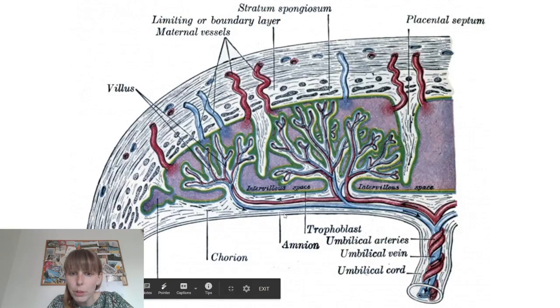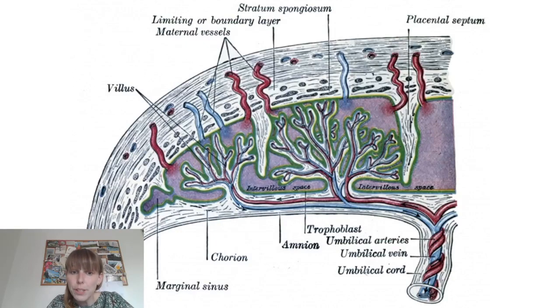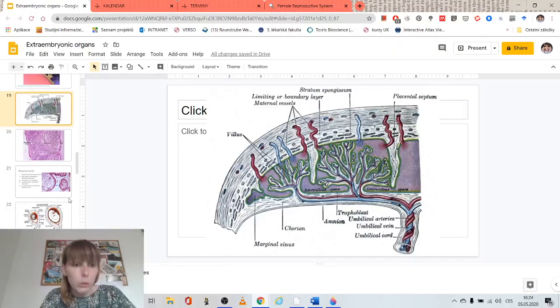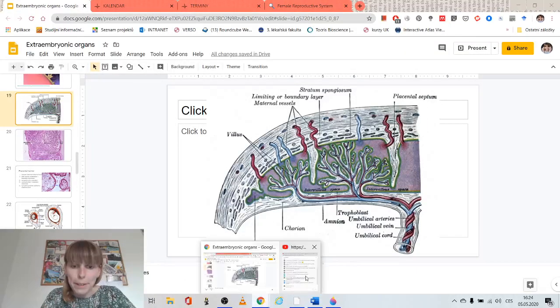So here we will have the amniotic epithelium. So amnion, thin layer here, which fused with the chorion here, as well as in all the other areas of the wall of the uterus. And so extra embryonic mesoderm and lining with one side from amnion, on the other side from trophoblast. So I think that's it. We will take a look under the microscope as well.